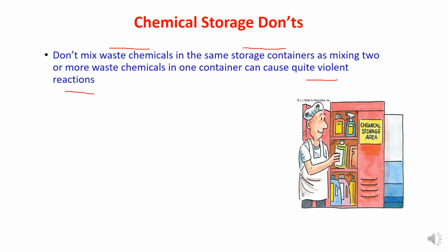So for instance, if you use different chemicals, of course don't mix them together into the same storage. According to the waste type, there are certain storage baskets, kind of plastic, that you can see in each lab. They are labeled with different chemicals, and you can just follow the instructions.